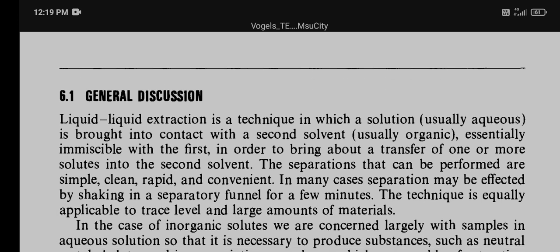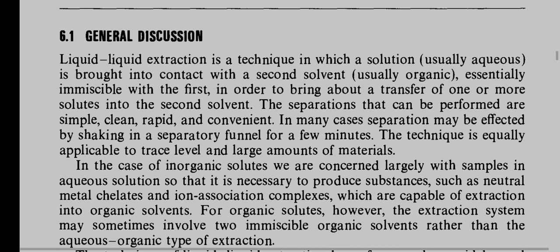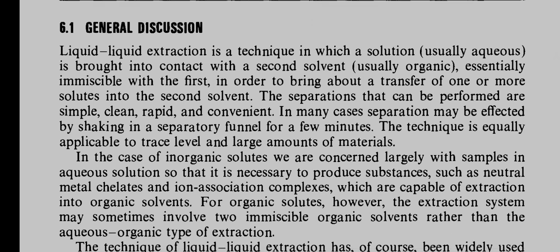General discussion. Liquid extraction is the technique in which a solution, usually aqueous, is brought into contact with a second solvent, usually organic, essentially immiscible with the first, in order to bring about a transfer of one or more solutes into the second solvent. The separations that can be performed are simple, clean, rapid, and convenient.